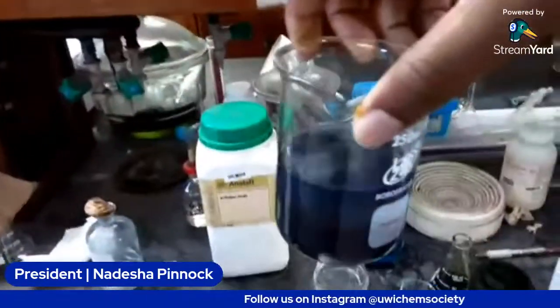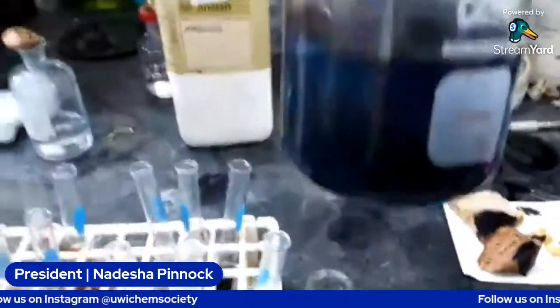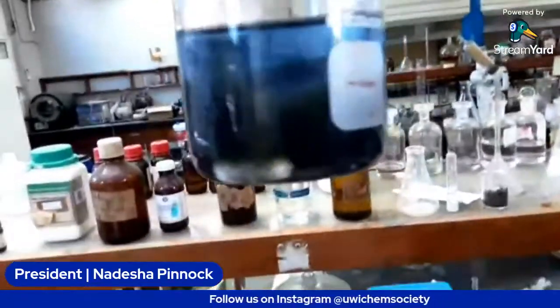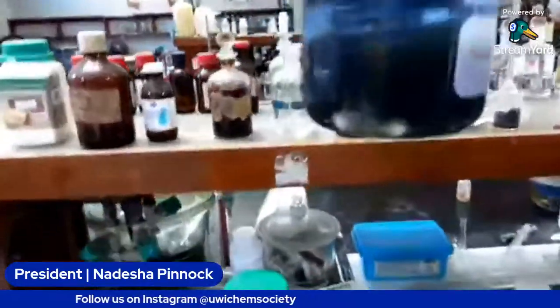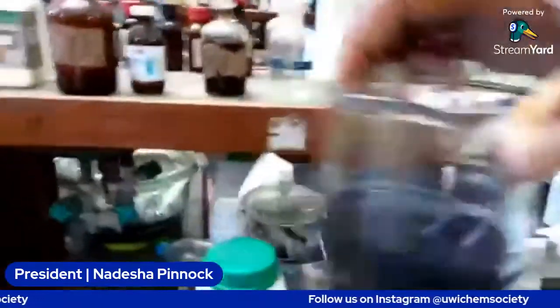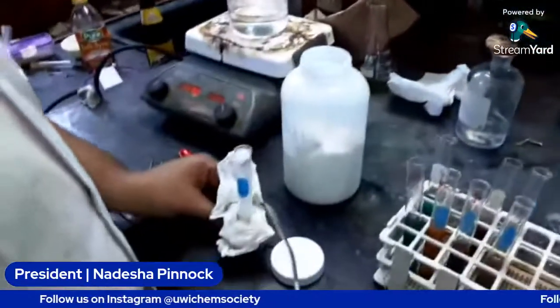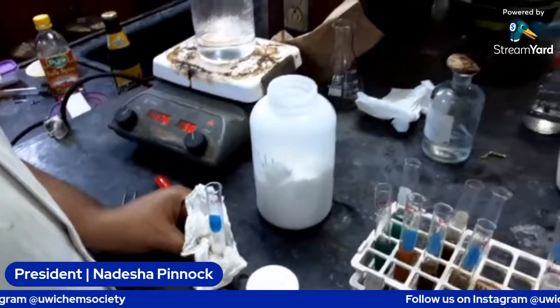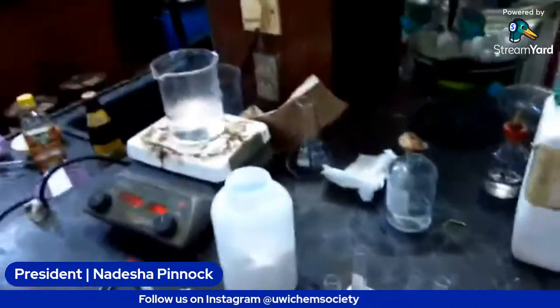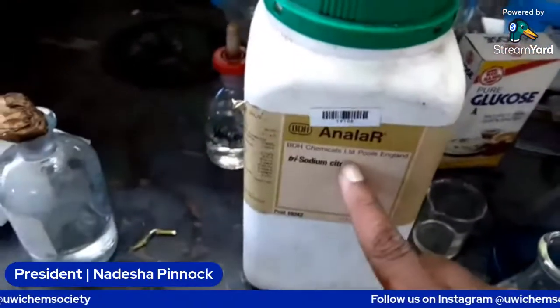Guys, an update. This was our Biuret solution. This thing fully formed a precipitate. Look at that, it's separating, but remember that we didn't put any stabilizing agent. That's why it's doing that. So when you don't use stabilizing agents, you have to use it quickly. The Benedict's can be stored because we put the trisodium citrate.